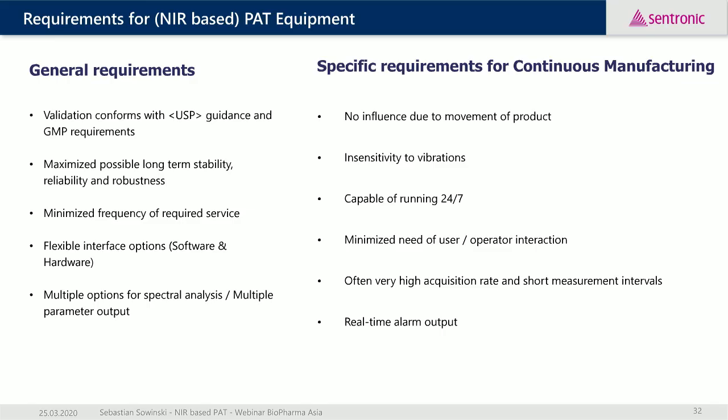It has to have very long-term stability, and also, over this long term, high reliability and robustness. The owner of a system, of a PAT tool, is always interested in minimizing the frequency of required services, and for integration into new but also into existing lines, it's important to have flexible interface options for software and hardware, and to have multiple options for spectral analysis and multiple parameter output.